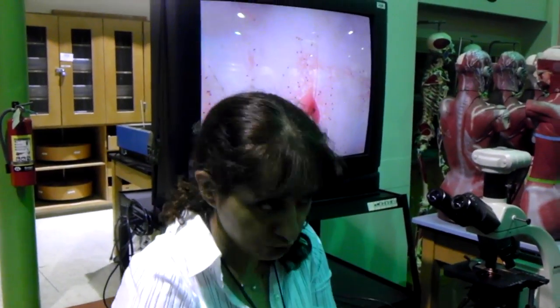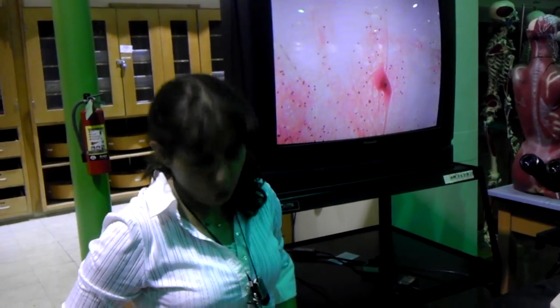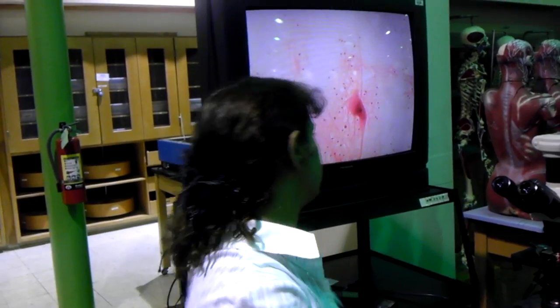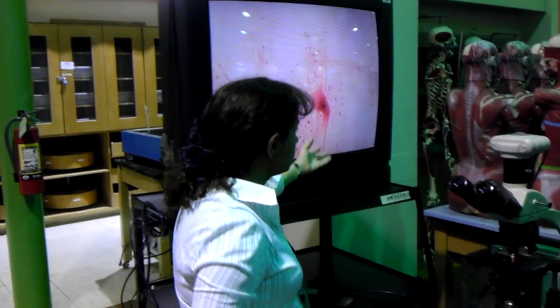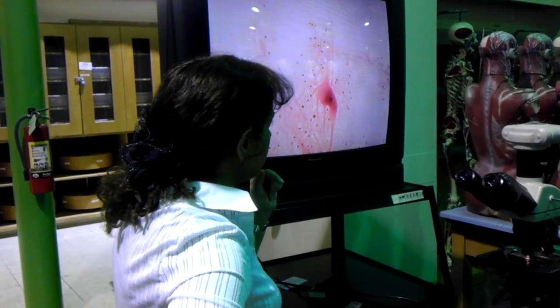You know that the major function of the neuron is what? Making the action potential, the nerve impulse. And the major function of the neuroglia? Supporting, nourishing, and protection of the neurons, right? So this is a typical neuron. I tried to find the beautiful one for you. The test also you will have a good one, hopefully.